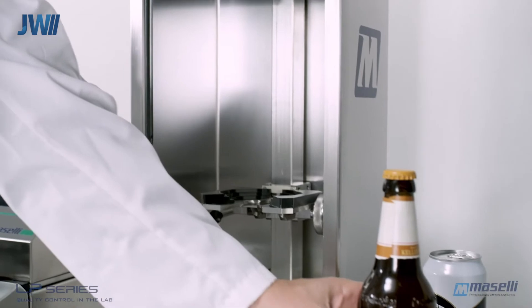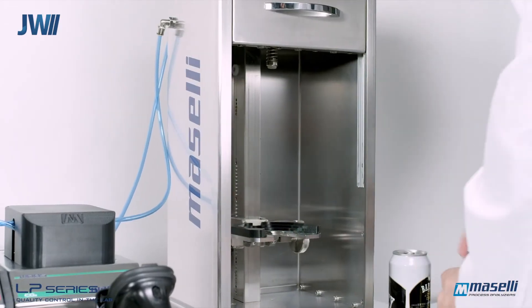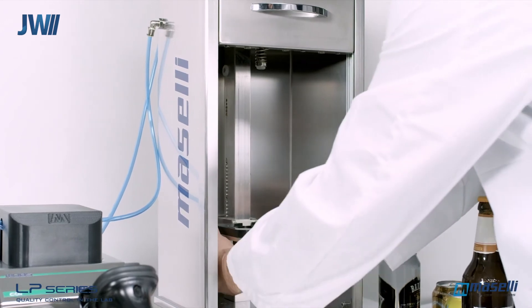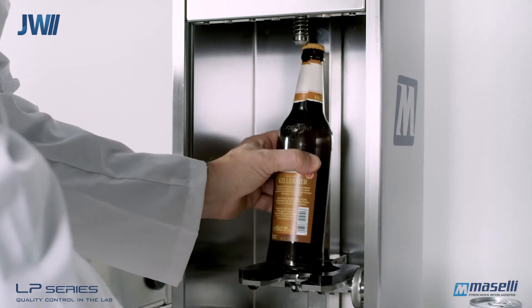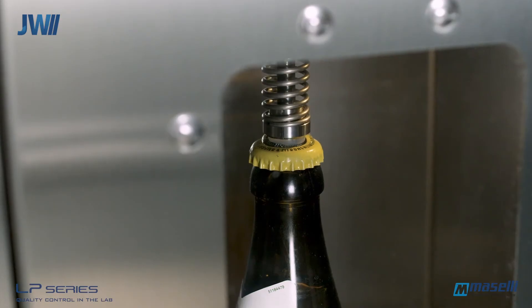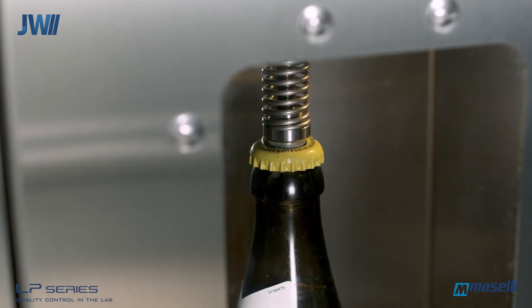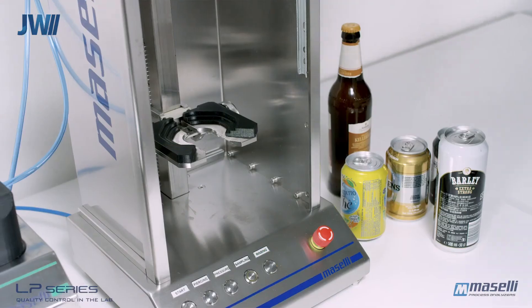The same sampler can be used for glass bottles with metal caps, and the sample holder simply adjusts to accommodate different bottle heights. The metal cap is pierced in the same way as the PET cap. Here you can see the sample hole pierced in the metal cap.